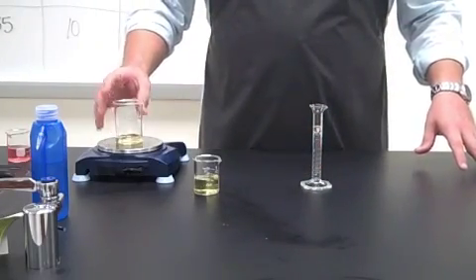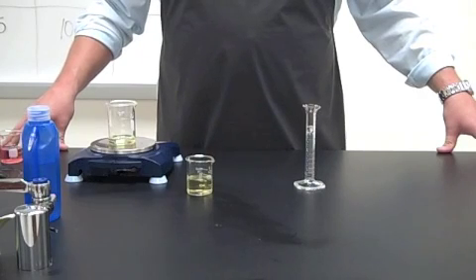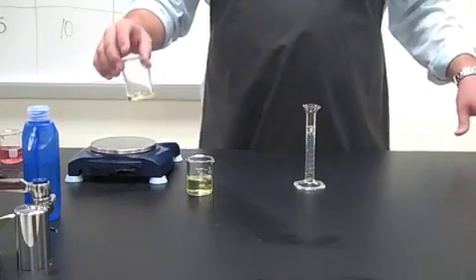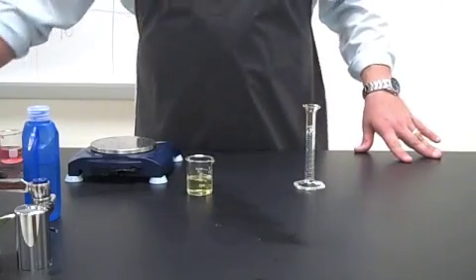Put it back on the balance and record its mass. And we see that it has a mass of 10.37 grams. So we see that the mass has gone up in this 10% mixture. We can again pour this down the drain.